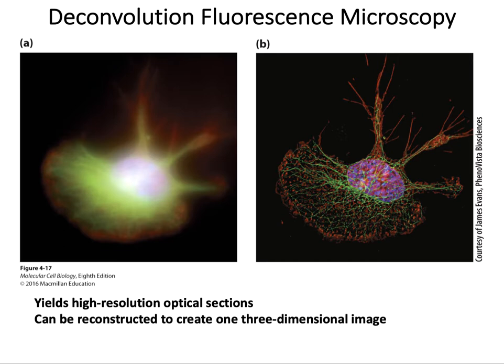You focused your microscope precisely at the 3 micron plane of the 5 micron thick sample. So only the sample at the 3 micron plane is perfectly in focus. But the 1 and 2 micron levels above the 3 micron slice are out of focus.